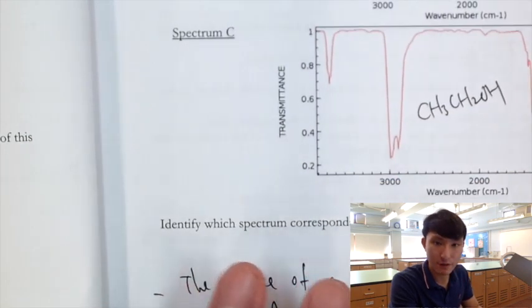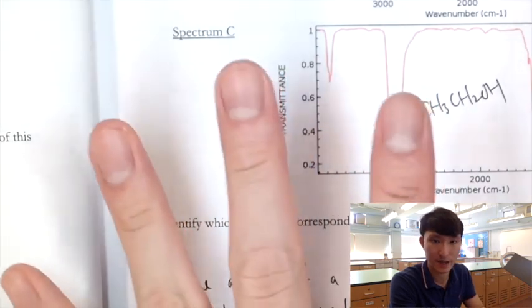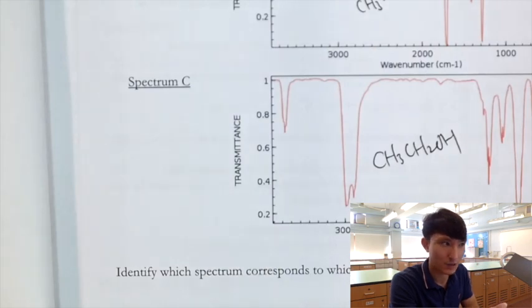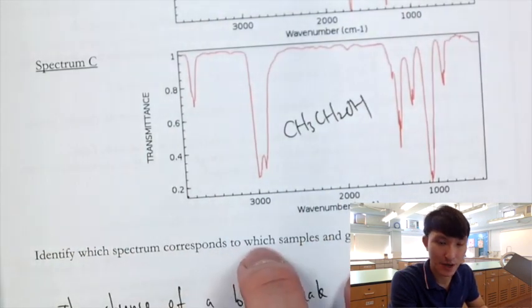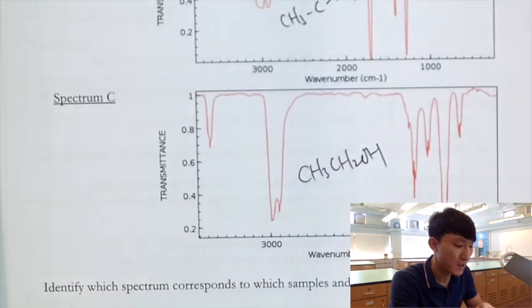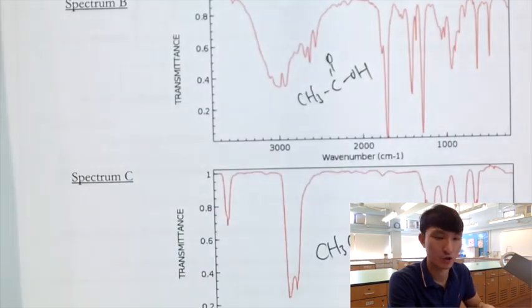So that's it for the infrared. To be honest, for this kind of spectroscopic technique, you do not need to understand a lot of concepts, right? You don't need to understand what is going on. All you have to know is how to interpret the spectrum and how to make assignments or deductions. Okay? So that means you need more practice. The more practice you have, the more comfortable you will feel with the spectrum. You will require less and less time to extract all the information from the spectrum. So more practice is crucial.